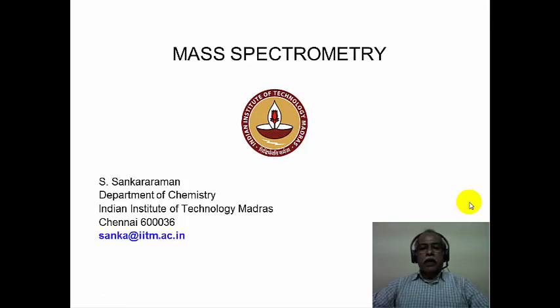Hello, welcome back to the course on application of spectroscopic methods in molecular structure determination. We are in module 18 now. In this module, we will consider certain fragmentation patterns of organic molecules under electron impact ionization mass spectrometry.